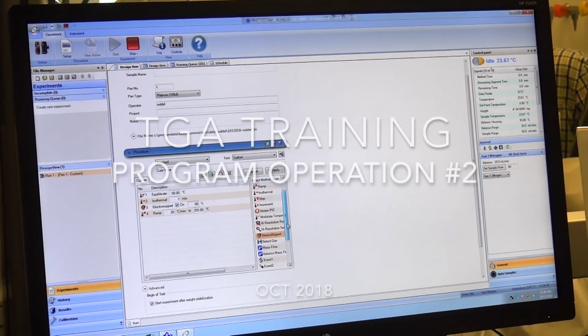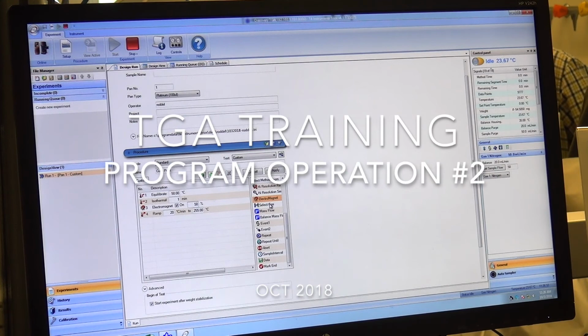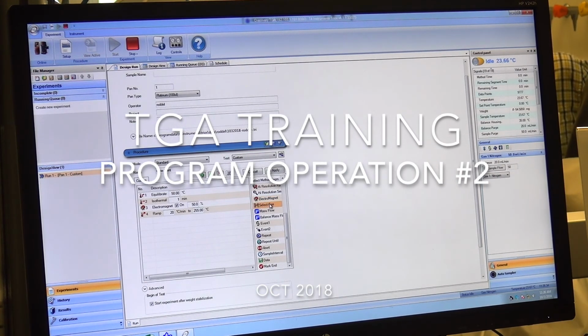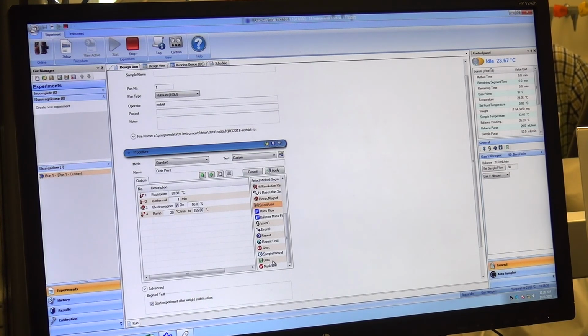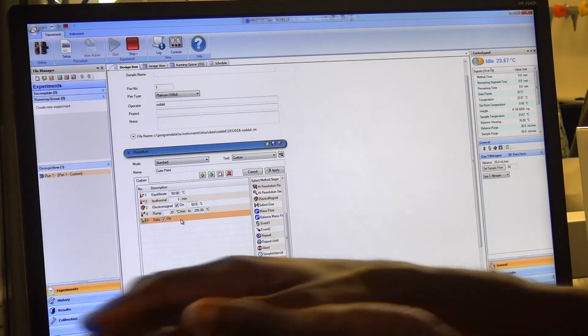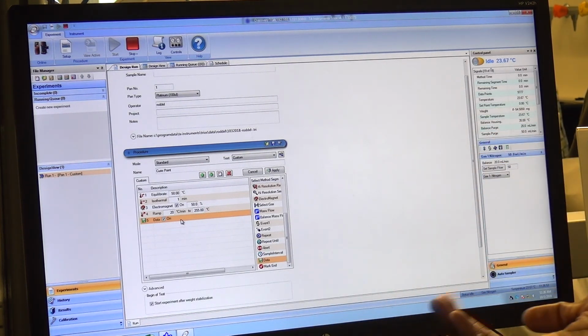All right. And again, feel free to go through this list. There's the select gas function in here as well that will allow you to switch gases. There is a data on, data off command. I can just drag that up in here. So basically, this command will allow you to sort of eliminate certain chunks of your experiment from being recorded, essentially.